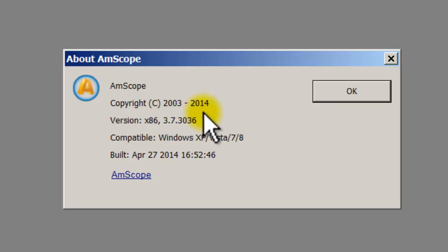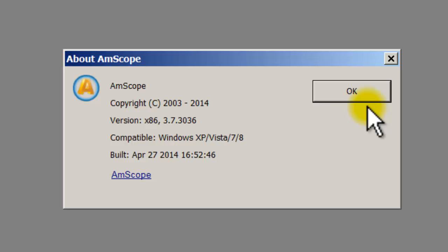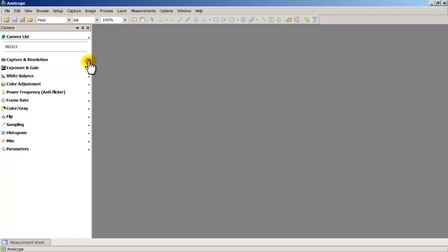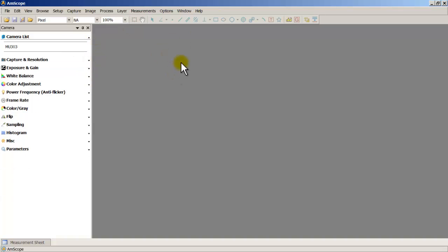After downloading, go ahead and uninstall the current software you have and then reinstall this one. A lot of people who call in say that they calibrated it but the calibration is coming out wrong, or it's still coming out in pixels. That basically means you might have calibrated it incorrectly.